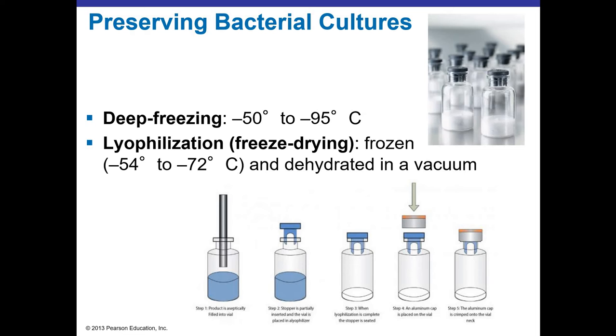We store all of our bacterial stocks in a -80 freezer so that when we need that new stock, we can just go there, pull it out, and start growing it back in either liquid culture or on a plate, and it does perfectly fine.